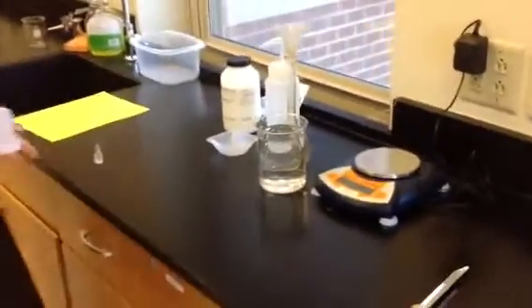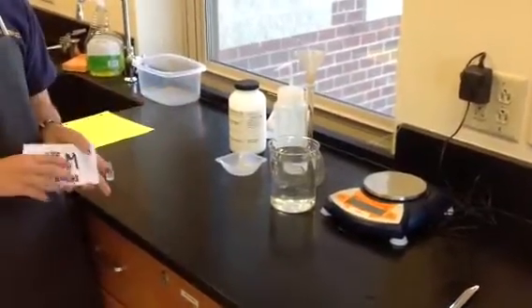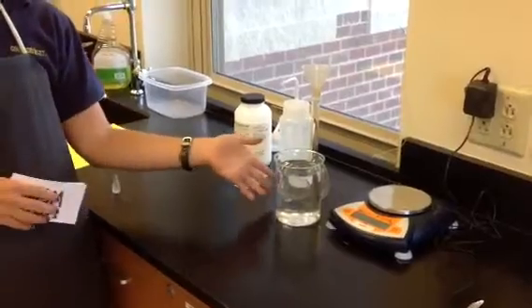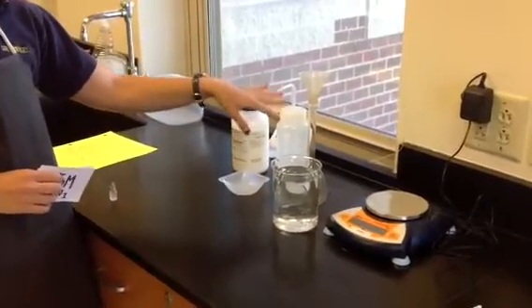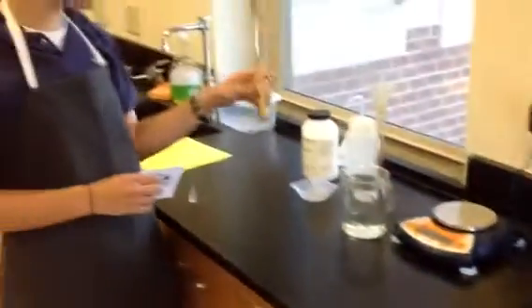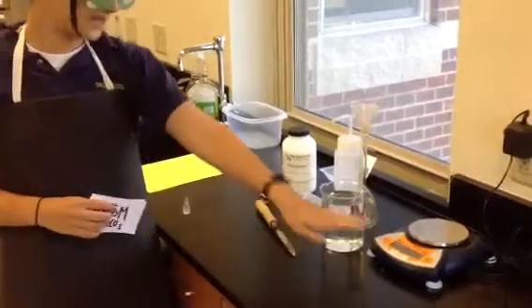First I had to get all the materials I needed: a 250 milliliter volumetric flask, a funnel for the water, a beaker full of distilled water, a squirt bottle also full of distilled water, a spatula for transferring the calcium carbonate into my weigh boat, and a scale.